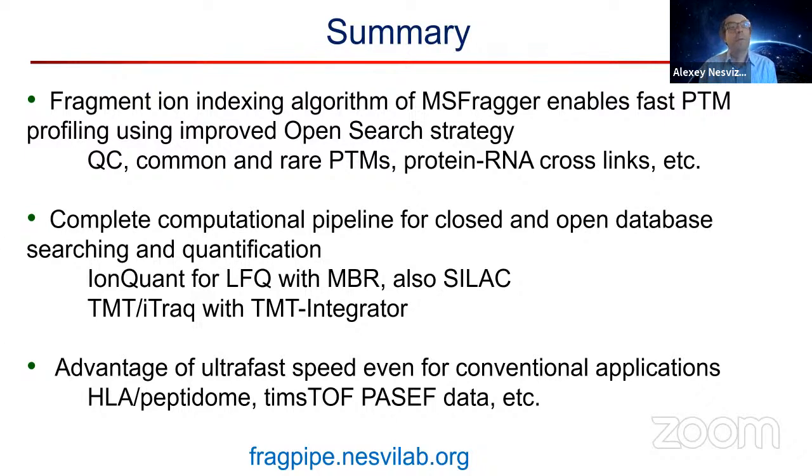When you think about this, we have an m/z value from the experimental spectrum, say 1000 Dalton, and we have all candidate peptides in a database, and we can calculate m/z values for those candidate peptides. And they have to match within a very narrow tolerance. That means that we're only identifying unmodified peptides or peptides that contain the modification that we specified, or maybe an isotope error if it's a +1 shift.